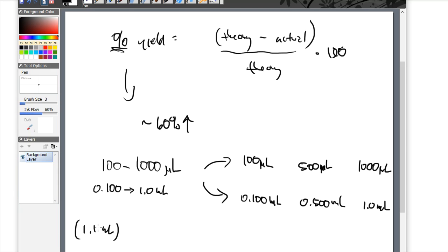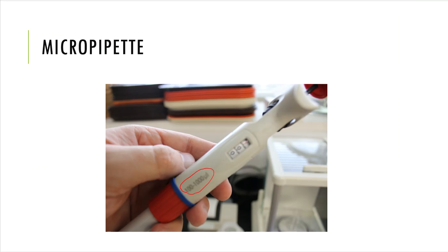And I'm not going to pipette it. I'm going to use a micropipettor. And I'm only going to pipette 1 milliliter of water into that container. In other words, the dial on my micropipettor has to stay at 1,000. Now, if I look at this dial and I look at the numbers up here, it says 100, right? There's a 1, there's a 0, there's a 0.